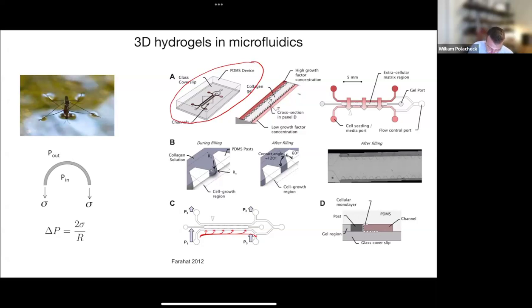But you include a bunch of these little trapezoid channels, these sawtooth-like structures that are in the center channel within this device. This device has 3 parallel channels, which can be seen in various views here: dark red, kind of gray, and light red here. These are the 3 parallel channels. And then it's the sawtooth structure that separates them.